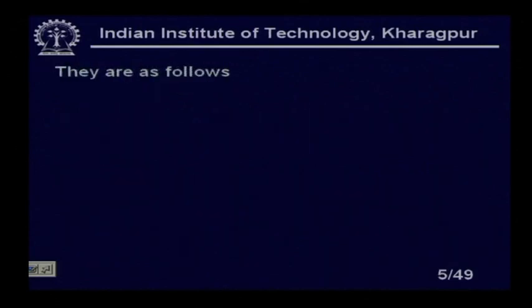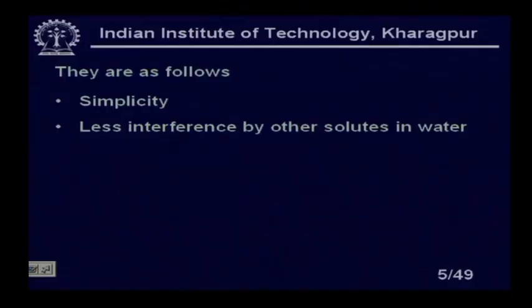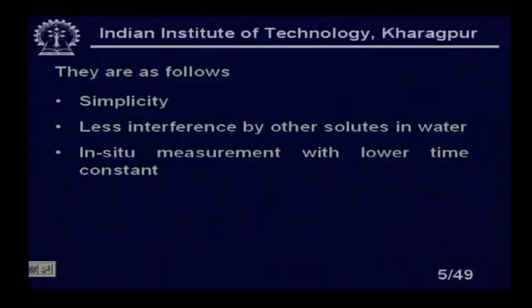They are as follows. What are the simplicity? Their design is very simple, okay. Less interference by other solutes in the water. If you have a chemical analysis, if you want to measure the partial pressure of oxygen or the dissolved oxygen concentration, and you have some other solutes, those will also react with your sample, so that will create a problem. You won't get the exact value of in situ measurement with lower time constant.